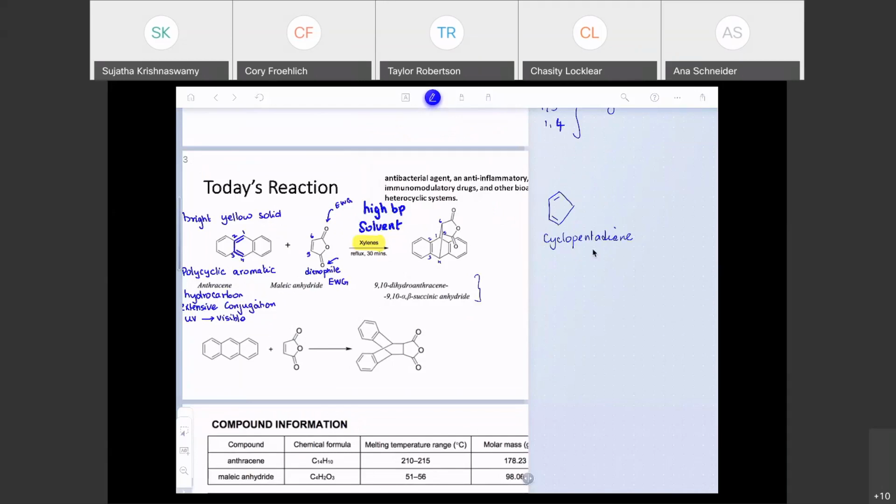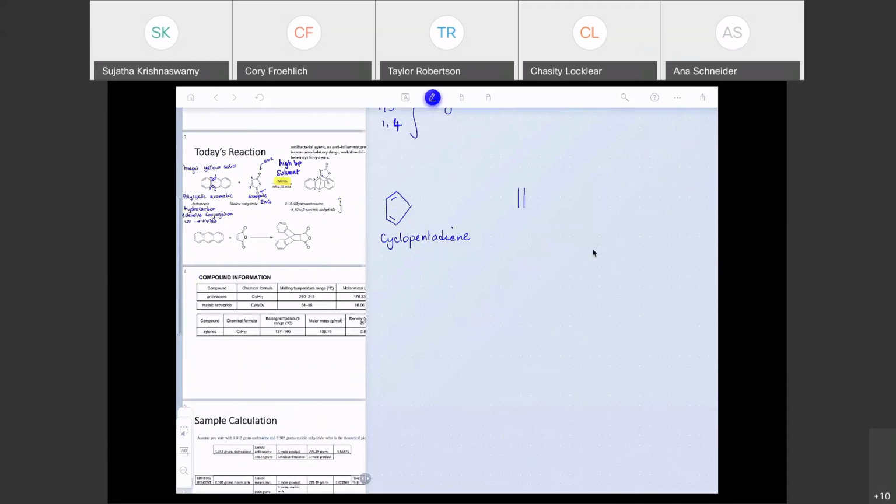We use the same maleic anhydride, which is a white solid. Our reaction is simple and straightforward. The advantage of this reaction is that you can just do it at room temperature. If you want to warm up the reaction, the most you go is 40 degrees Celsius. With xylenes, you're going to hit a very high temperature. So this is a much greener modification of that existing reaction. The reaction only takes approximately 10 minutes at the most. This takes 30 minutes.